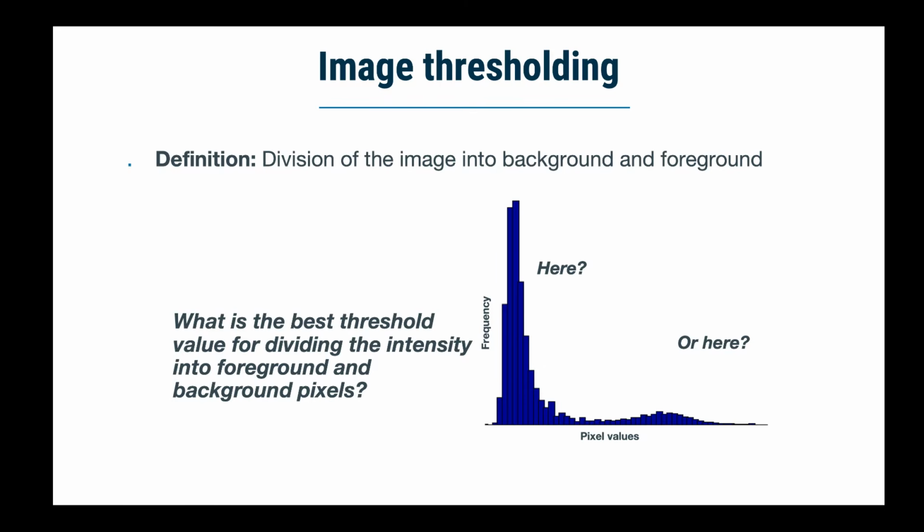The concept of thresholding is simple. When you have a digital image, which is just a bunch of pixels that all have a different quantitative intensity value, you want to figure out which of those pixels belong to your stuff and which to your non-stuff. If you're working with fluorescent images, essentially always what you're going to do to create a threshold is look at the histogram of the values. Your background in a typical fluorescent image might have a low pixel value, not that bright, because there's nothing there. And your signal might live up here, where there are higher pixel intensity values.